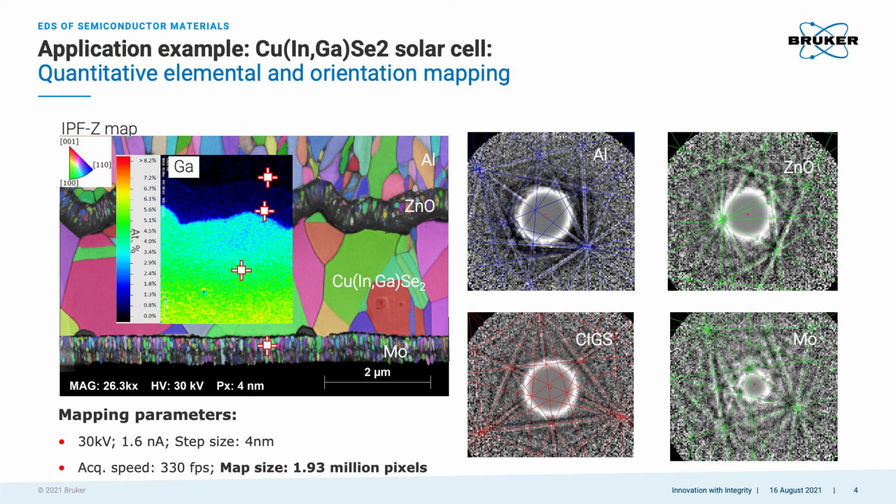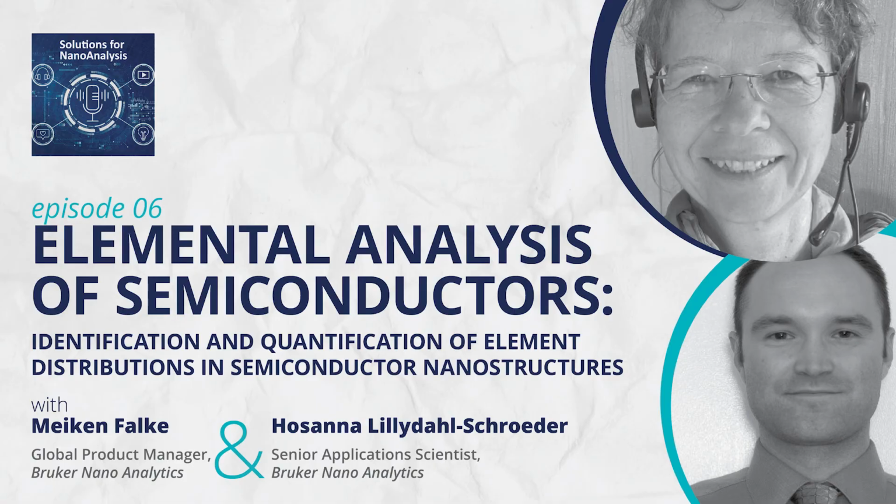Yeah, maybe we should talk about that now. What do you think? Sure. So as far as these different sizes and types of detectors, what sort of timescales are we talking about as far as data acquisition and time for analysis, that sort of thing? Yeah, I like to explain things so people can imagine, not just give numbers. Acquisition times reach from hours to seconds. That is not very informative.